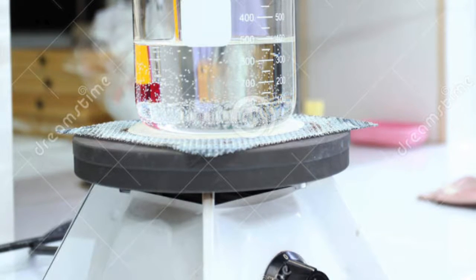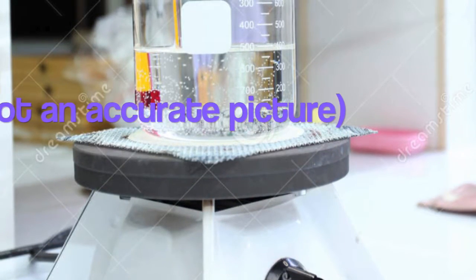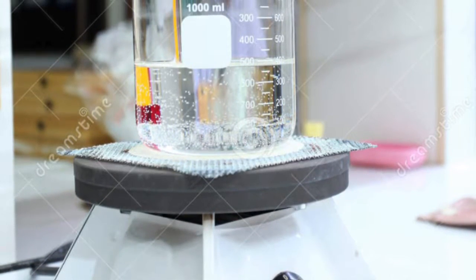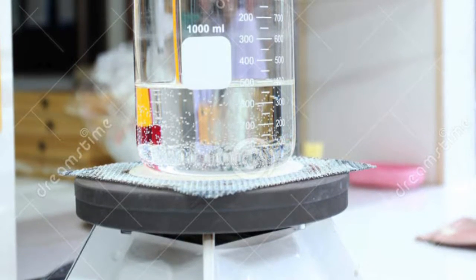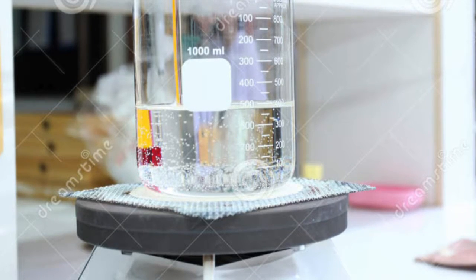Once the initial portion of sulfuric acid was poured into the solution, a puffy, thick, white alum precipitate formed. This substance formed due to the addition of positive H+ ions from the sulfuric acid. These ions accepted the negative charge on the aluminate ions, causing the aluminate ions to become solid aluminum hydroxide.